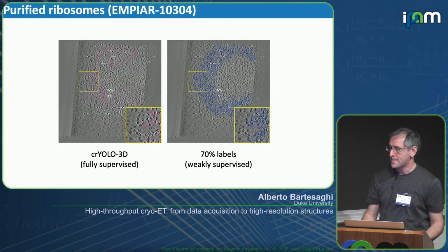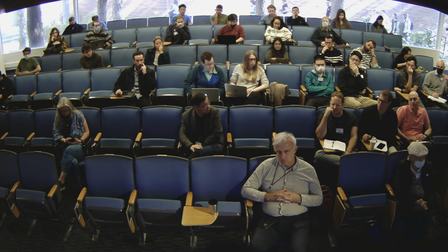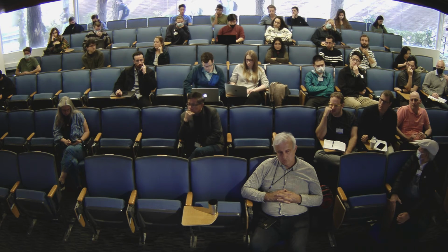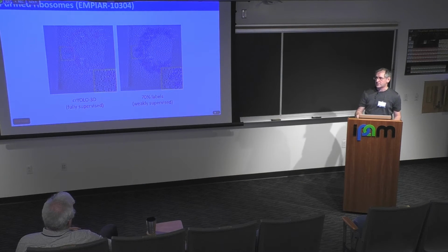Yes. Can you explain why particle picking is so much harder for tomography compared to SPR? Is it just the amount of data, or is there something else? Yes, that's a good question. There are several things. First, you have a third dimension, so everything is going to be more expensive computationally. Although, for picking, you heavily bin these tomograms, so they're not going to be that big, but still bigger than 2D.